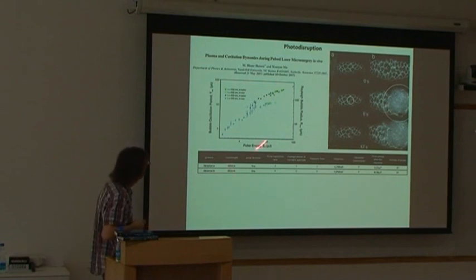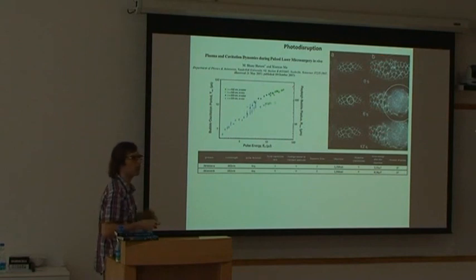So in the case of the 355, they can still detect bubbles, which will depend then on the pulse energy they put. While on the 532, which is a wavelength that is less energetic than UV, they will have to put even more power. This will create even more damage. So they will have to put more power to reach the plasma threshold.